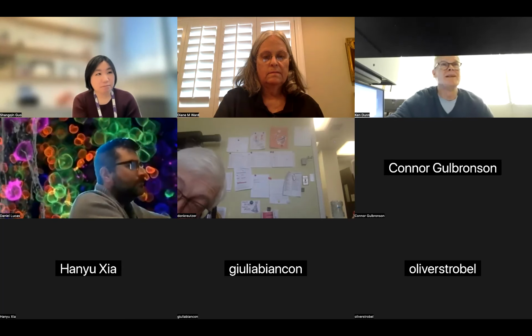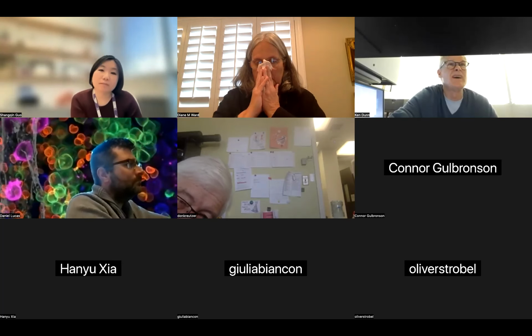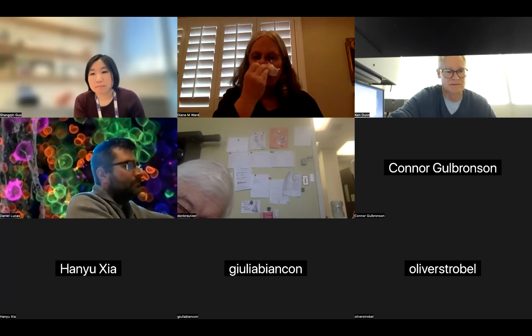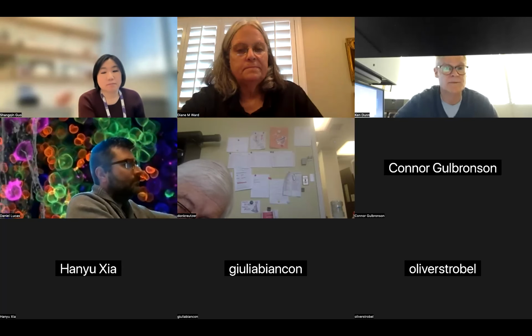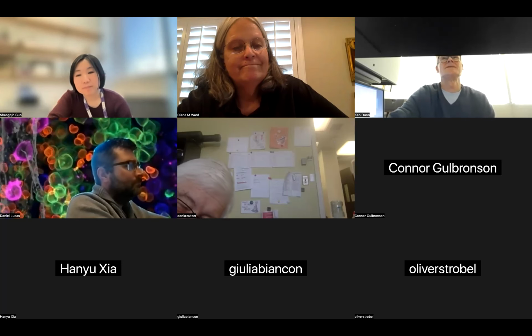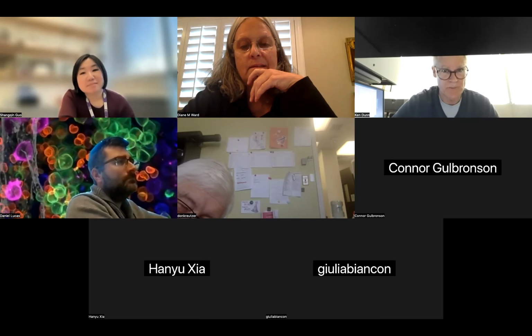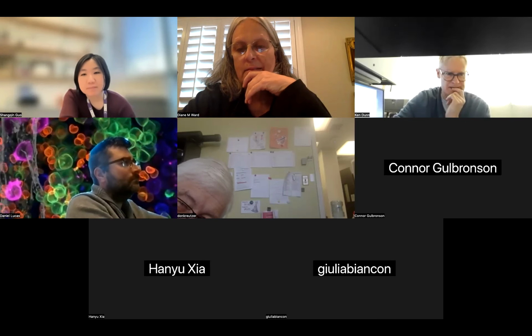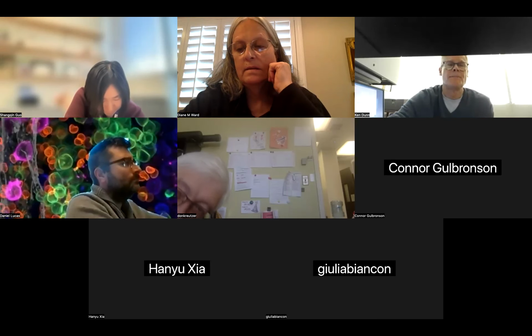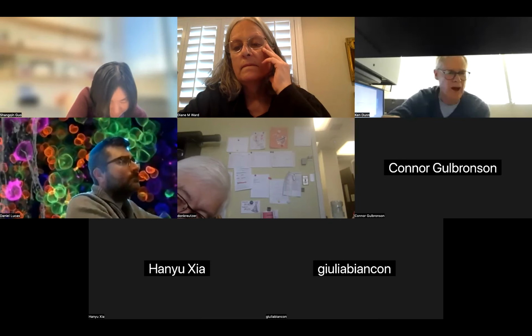It's interesting you bring that up. There's no reason you couldn't do that. But the advantage of light sheet microscopy is that it's going to give you scale, right? You're going to be able to see the entire object, perhaps, and see interactions with it. And this is a little self-advertisement here, if I can get this to display. So I'm not sure why you'd want to use light sheet for this necessarily. Because these are big objects, and histopathology, that stuff doesn't. How big are we talking about?